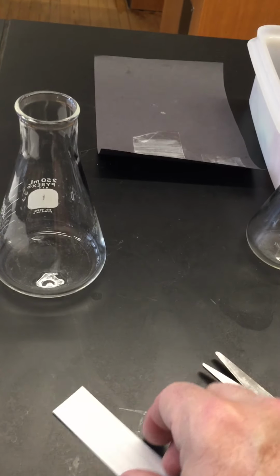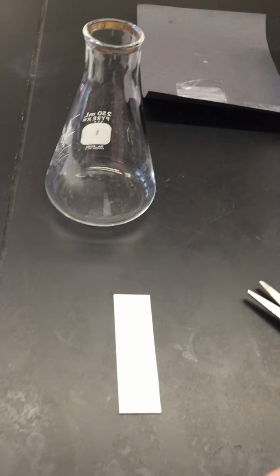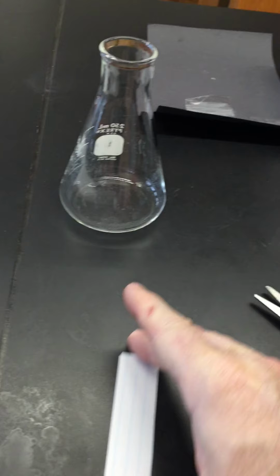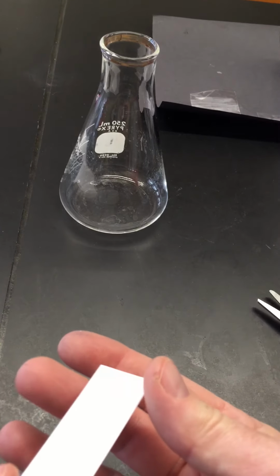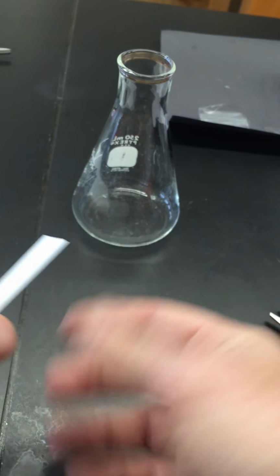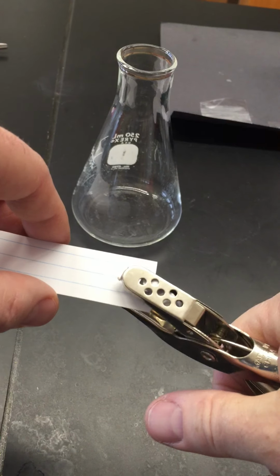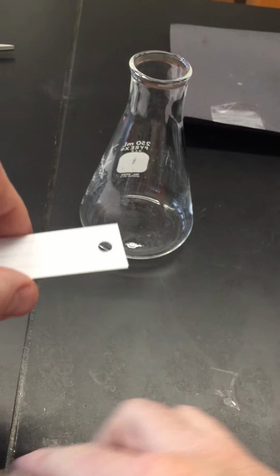Okay, so now I've got my piece down here. I'm going to gather it up first, hold it by the edges, and use the hole punch to put a hole in the top.